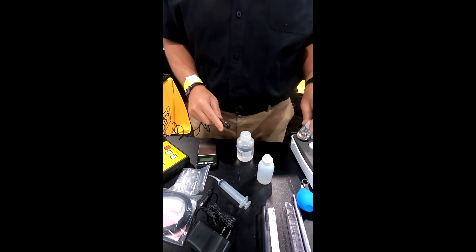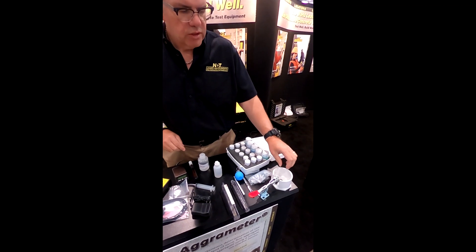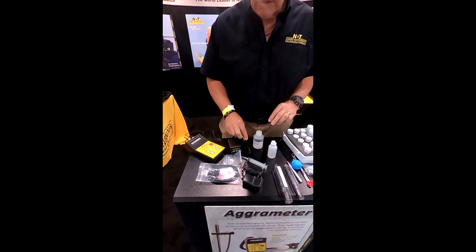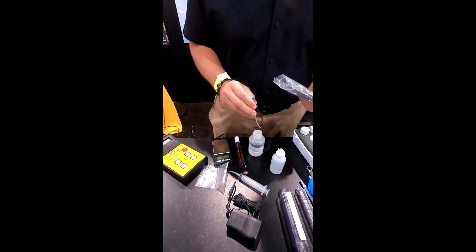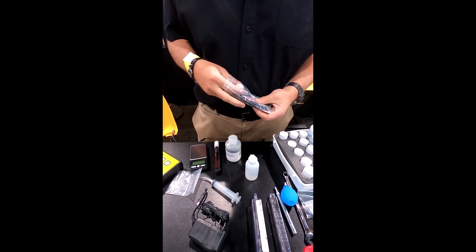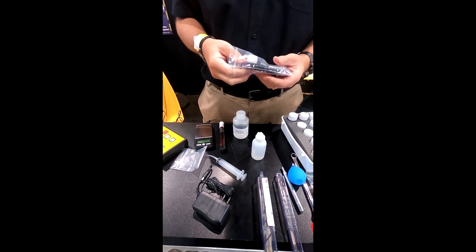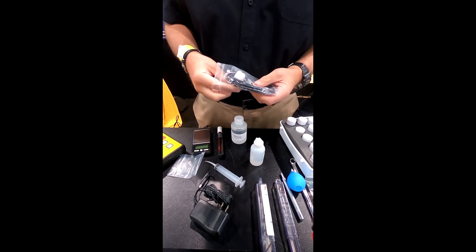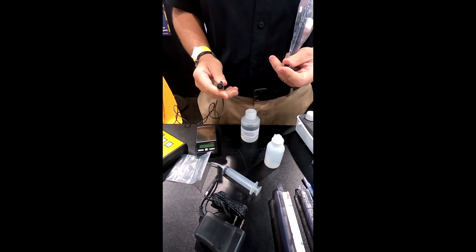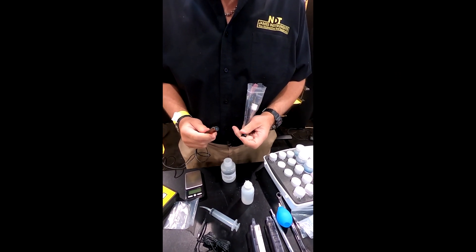Some key takeaway points: be careful when doing a profile — you don't want to contaminate your samples as you're bringing them up. You want to do a sample, then clean everything out thoroughly with a blower or similar device. Keep your electrode as clean as possible between readings — that's why we have the distilled water and the spray pump. You can use either the spray pump or the cap. We also have a small polishing strip for the electrode; you may want to polish it after a hundred or so readings, but you should take the time to keep it clean. Don't go heavy-handed on the polishing strip.